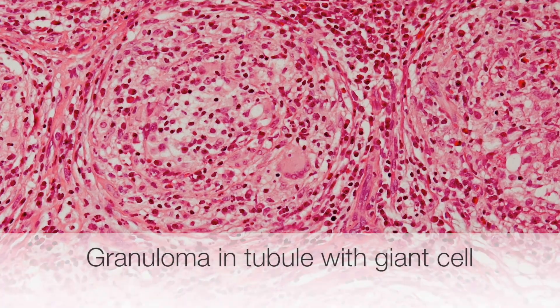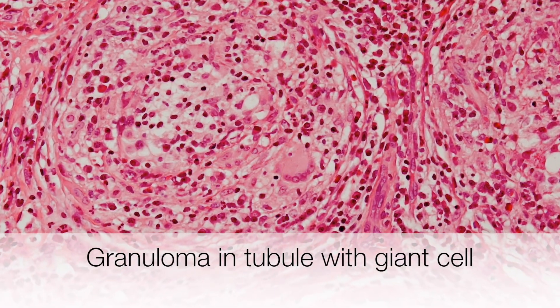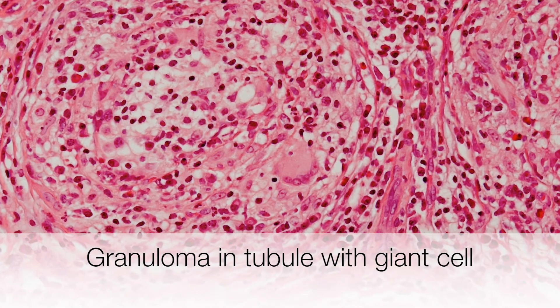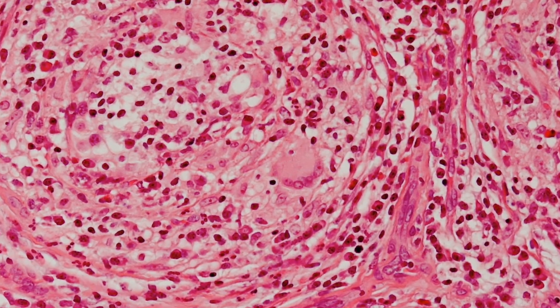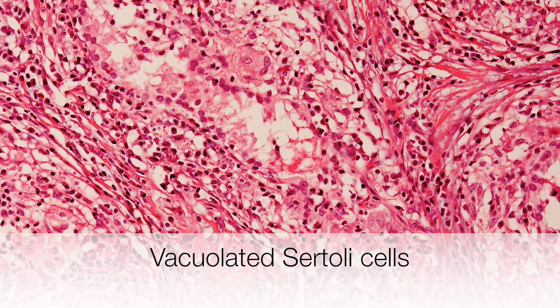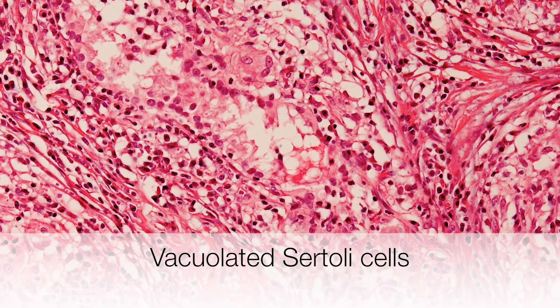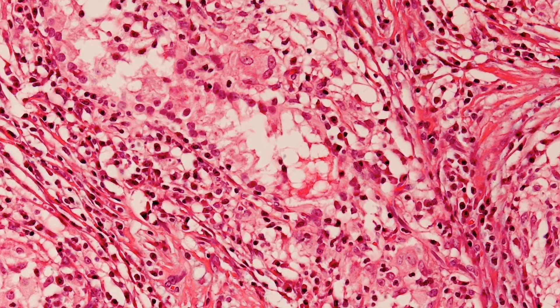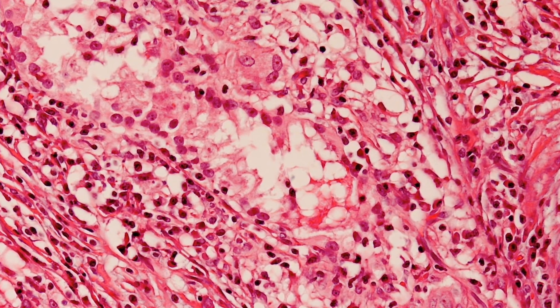Here is a high power view of a granuloma containing a nice example of a multinucleate giant cell. And finally, here is a picture showing the vacuolated Sertoli cells, one of the features of granulomatous orchitis.